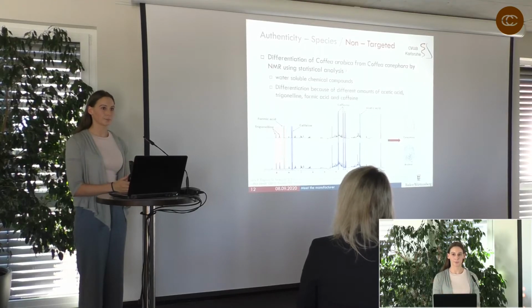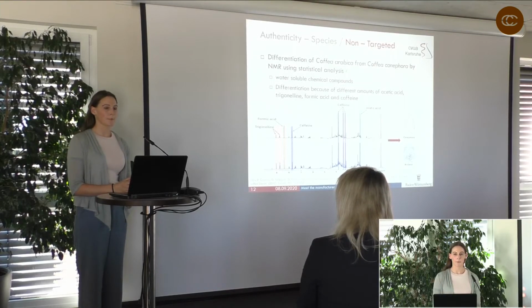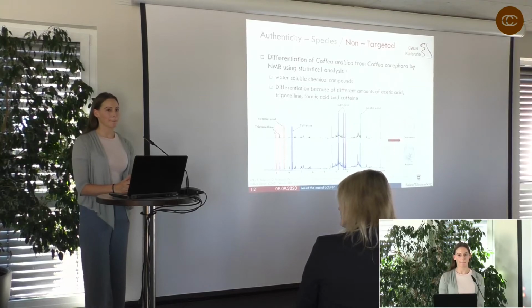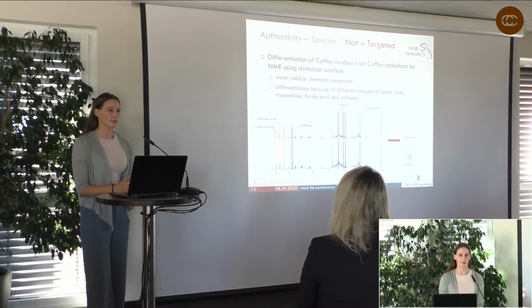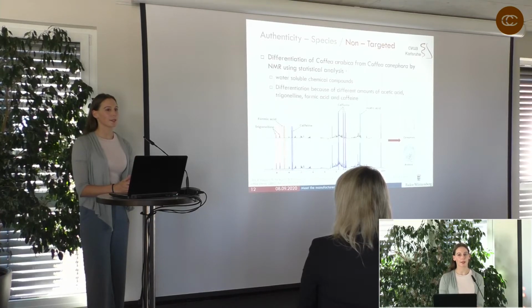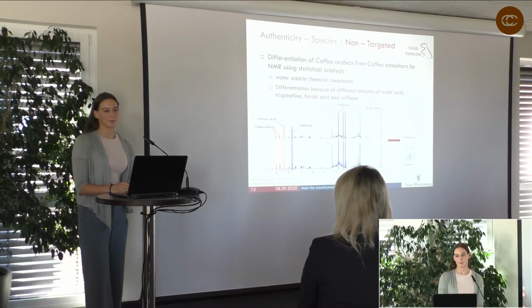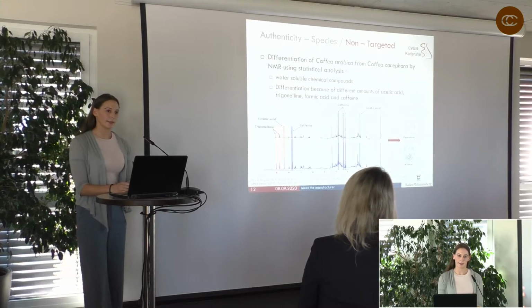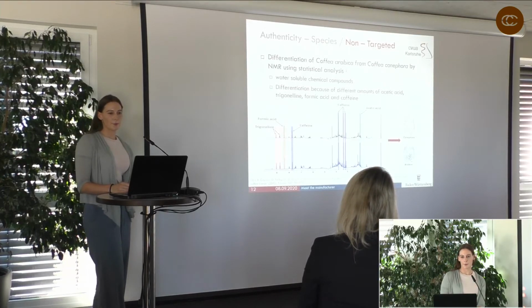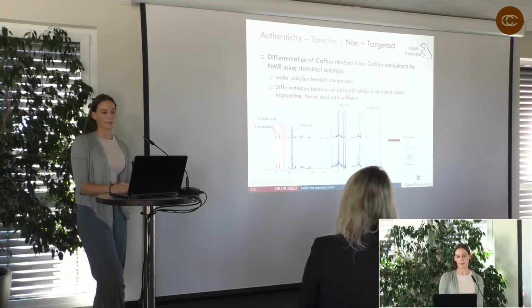Yes? When you showed the different spectra for the Canephora and the Arabica, I hardly could see a difference in the shift and also in the peaks. So did you do the statistics by your own, and how important is the statistics? Because when you want to transfer your knowledge to, whatever, a farmer who is trying to find out what he has, could you have some problem by just measuring the NMR spectrum? Yeah, the statistic analysis is very important because there are often a lot of differences which we can't see with our eyes. It's just a statistical software who detects these differences.